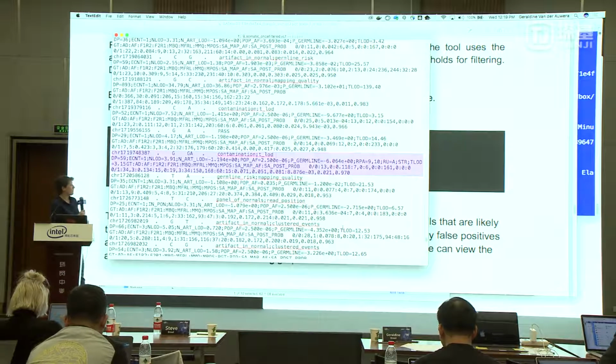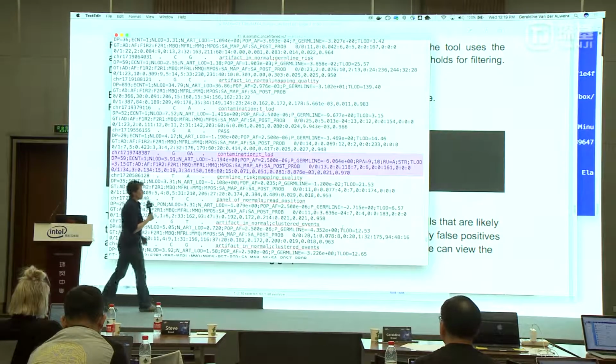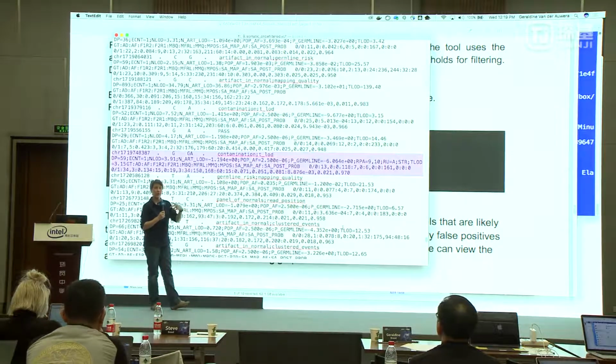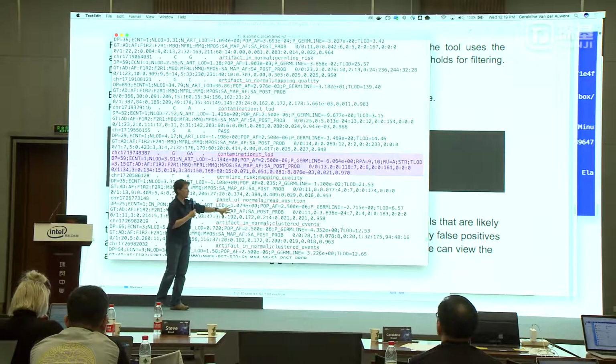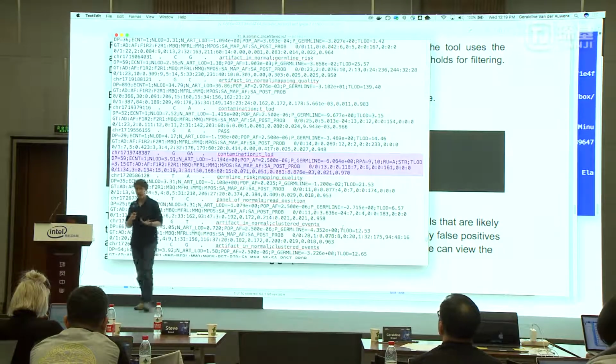Where are we on time? Okay, so we have about 10 minutes left. For the rest of the time, we're going to look at a few other variant records and try to understand when these filters were applied. Can we identify in the data the reason why they were applied? And based on that, we can discuss whether we believe that the variants are real variants or not.